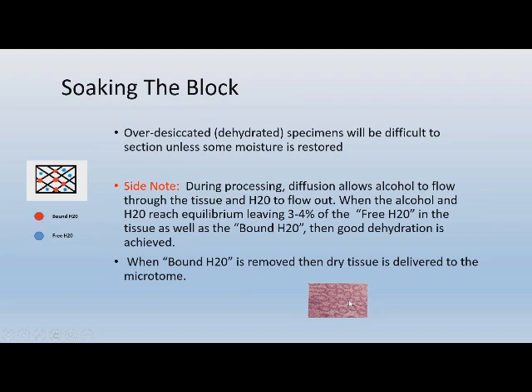It might look something like this. Typically, unfortunately, it happens more in tiny little biopsies than it does in anything else, because a lot of times we process our biopsies with breast, with colon, and I think we're getting away from that a lot more. And if you happen to be one that's having this issue, that's one of the things you want to look at, is separating your processing, even if you have to process your small biopsies alone during the day. They need a much, much gentler processing schedule. But you can get these little cracks in the tissue.